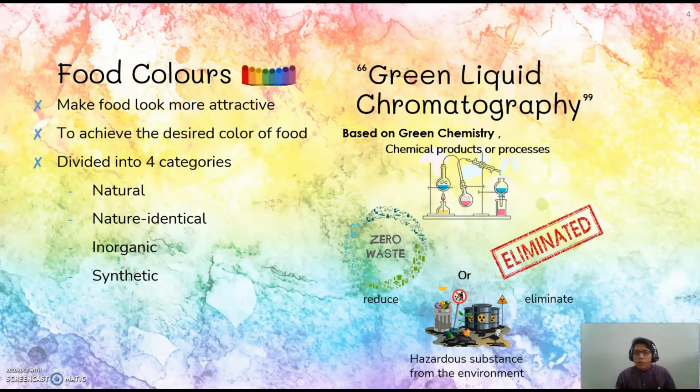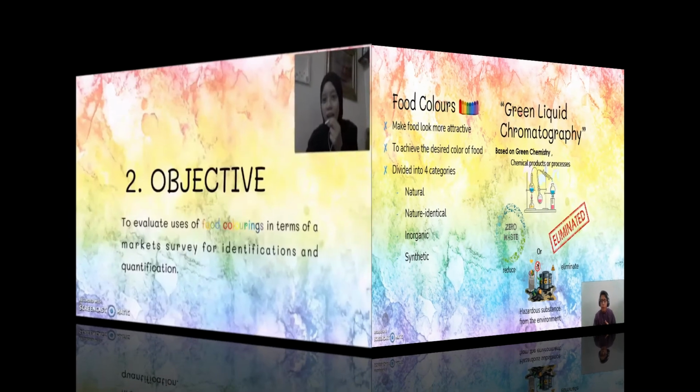As I mentioned earlier about the use of green liquid chromatography, this technique is based on green chemistry, which is the design of chemical products or processes in order to reduce waste and also to eliminate hazardous substances from the environment.